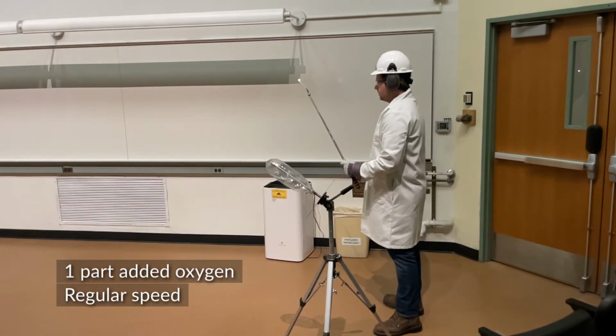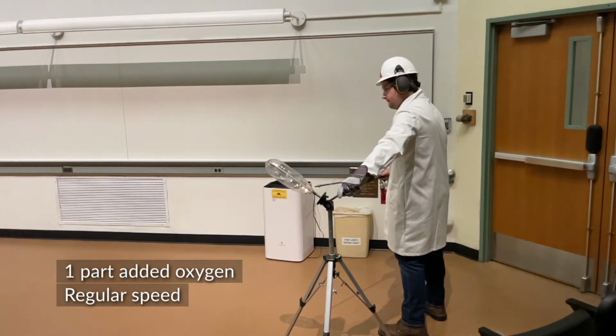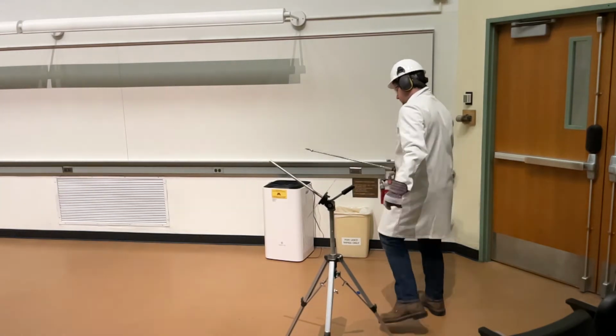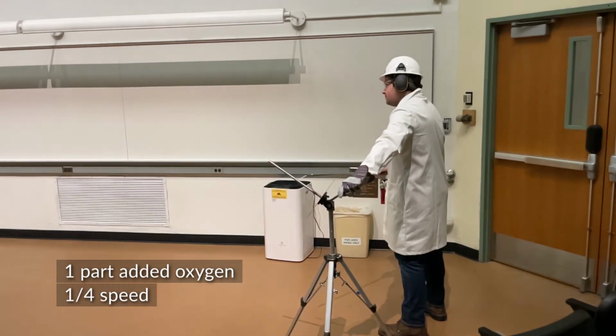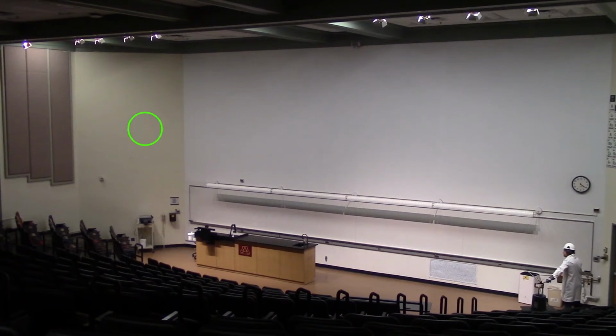This second rocket has the same amount of methanol vapor as the first, but I've added additional oxygen to it by holding the opening to a stream of oxygen for 1 second. You can hear that this rocket takes off with more force. With more oxygen, more methanol is able to react and it produces more energy. You can also see that this rocket flies farther, hitting the opposite wall of the lecture hall.